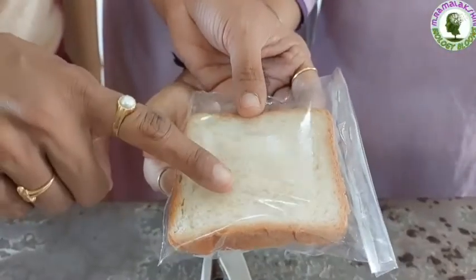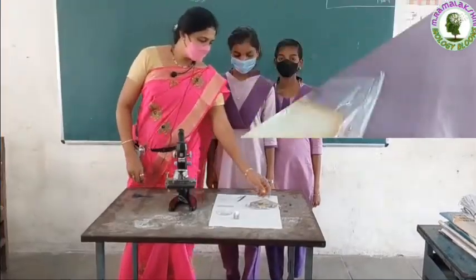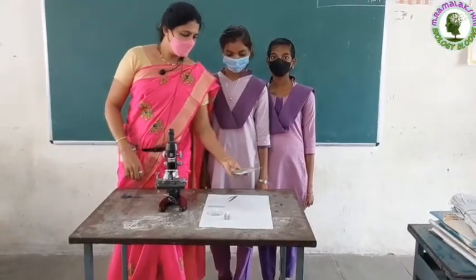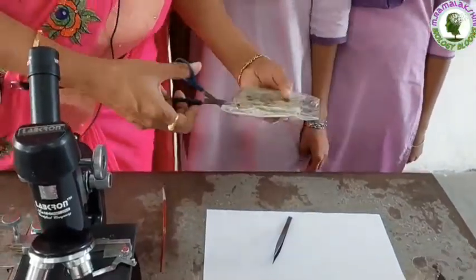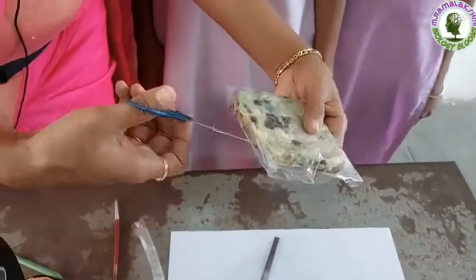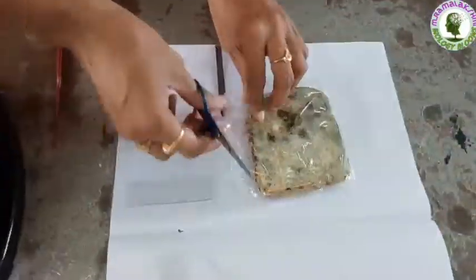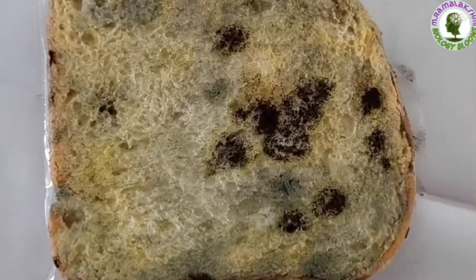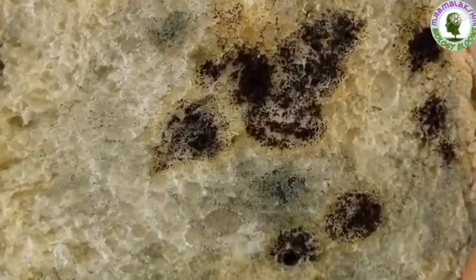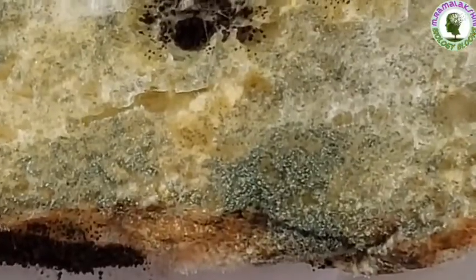Children, we will leave this bread for one week. After one week, children, observe this bread. Carefully cut the edges of this cover. Don't touch the bread. Children, observe this. You will find whitish thread-like growths with masses of black-gray dotted structures. The black dotted structures are bread mold.